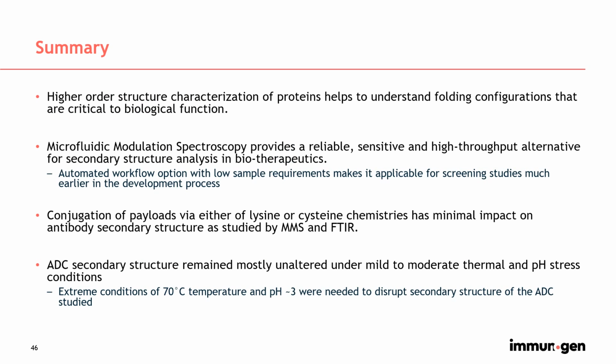So in summary, studying the higher-order structure of proteins helps to understand the folding configurations that are important in its biological function. Also, MMS provides a reliable, sensitive, and higher throughput alternative for secondary structure assessment of biotherapeutics, with the automated workflow option being a major advantage.